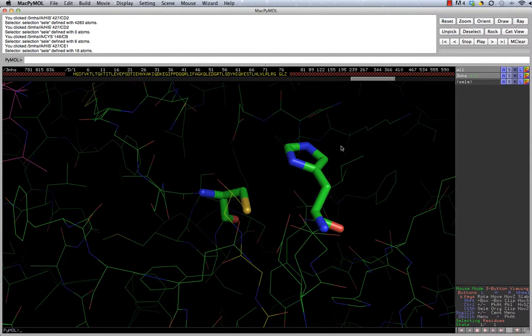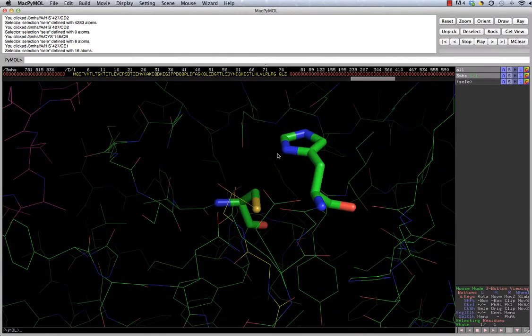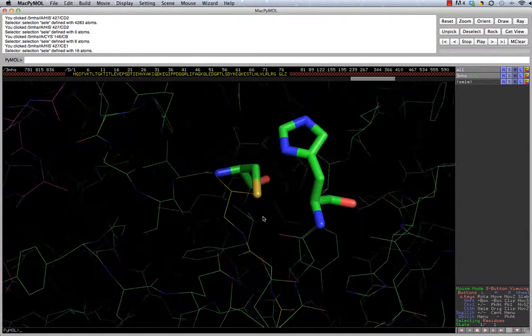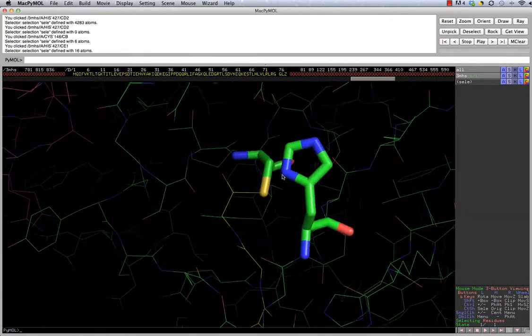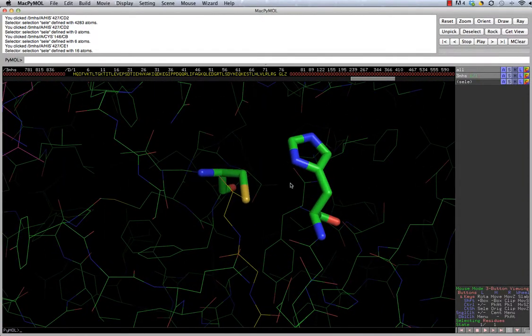Now let's say I want to know a little more about those residues. I want to get an idea of how they fill space, how they pack against one another. Now you know that these stick depictions don't give you any idea of space, so let's use a different depiction, and that's going to be a space-filling molecule. So I first want to get rid of this sticks depiction here. And you see these aren't selected anymore. So this selection option here has now gone black here.